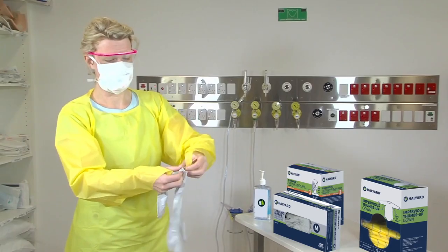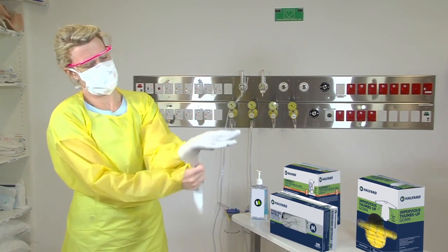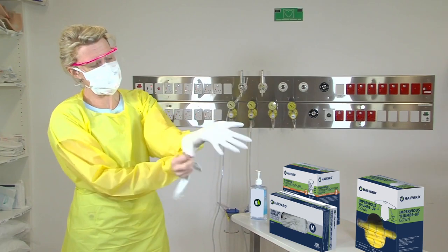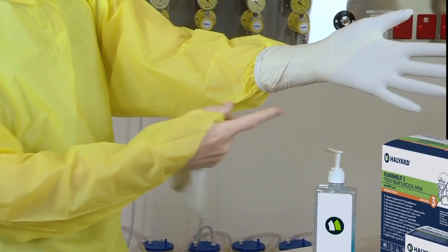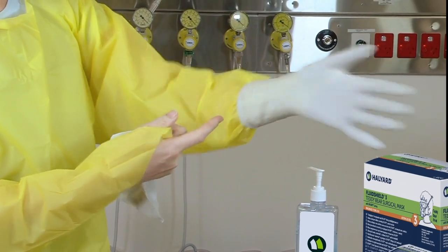The last item we're going to be putting on today are our gloves. Apply them, and remember there are different gloves available — you can get ones with an extended cuff to ensure that your wrist is fully covered.